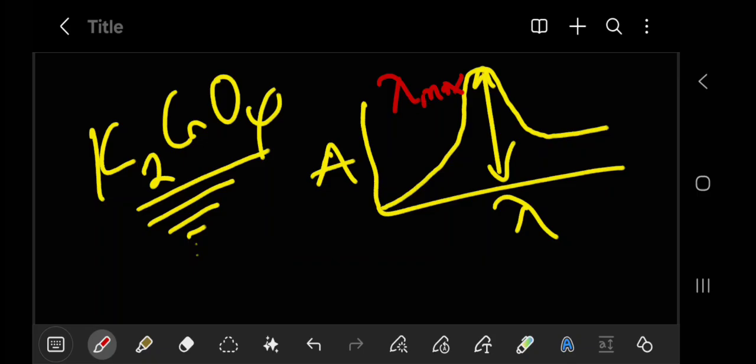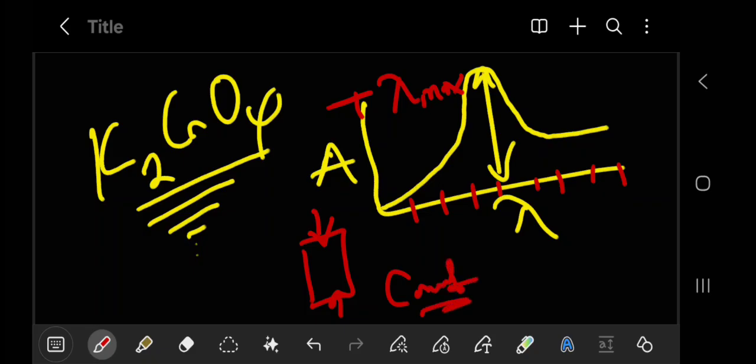With these different wavelengths, you have to vary them. You now get the peak wavelength, telling you this is the wavelength that the absorbing species, the component of the solution, is able to take in, and it will give you an idea of the concentration of the sample absorbing at this wavelength.